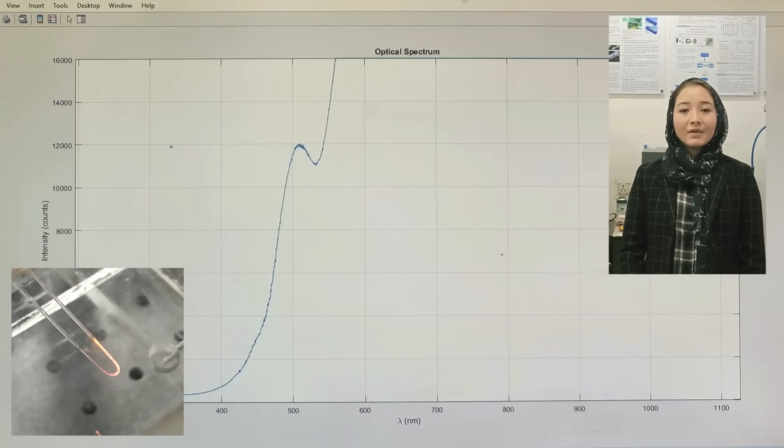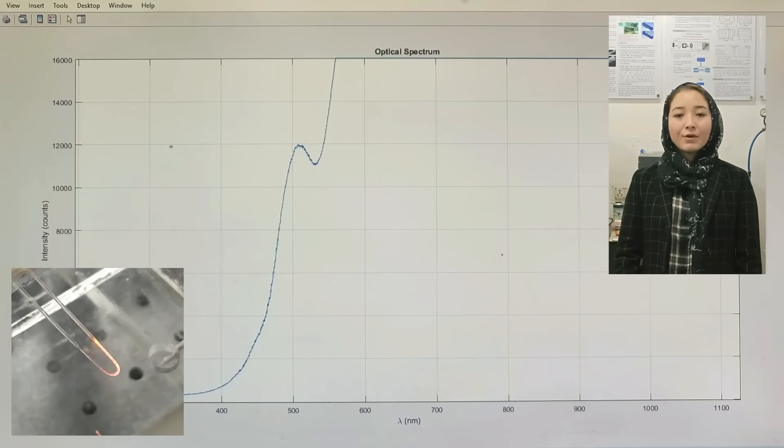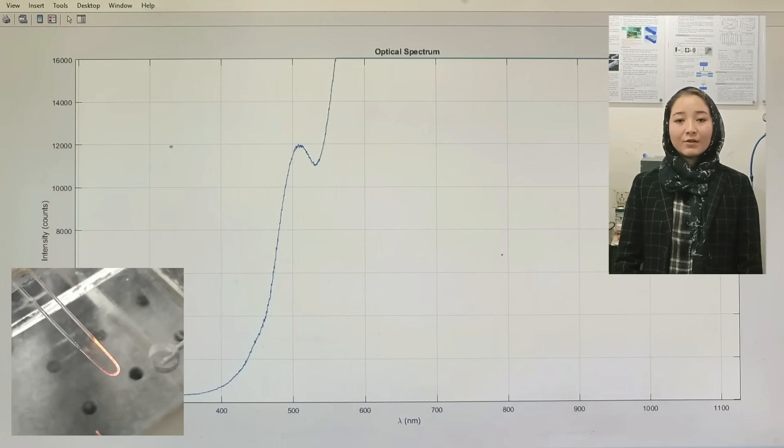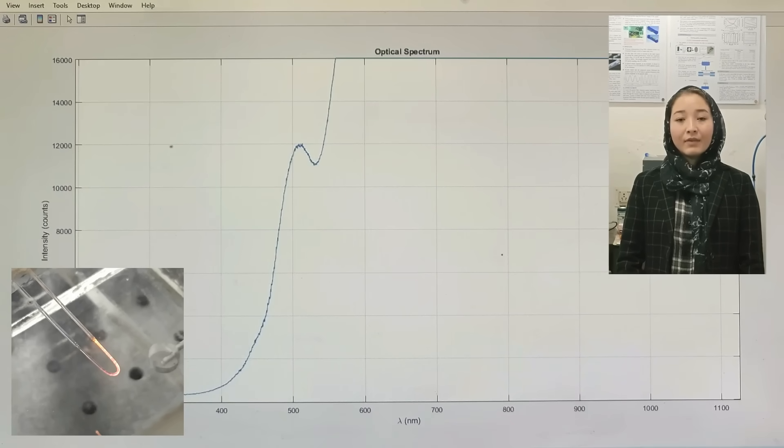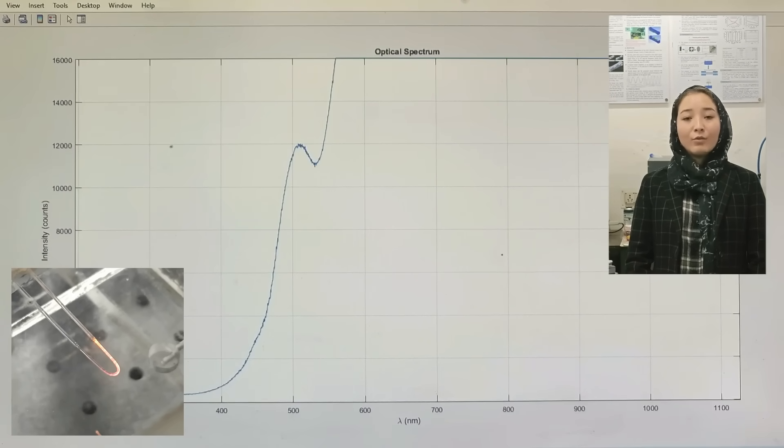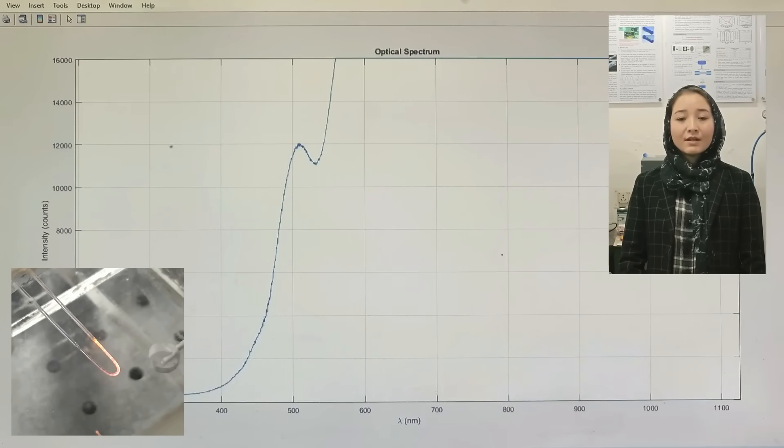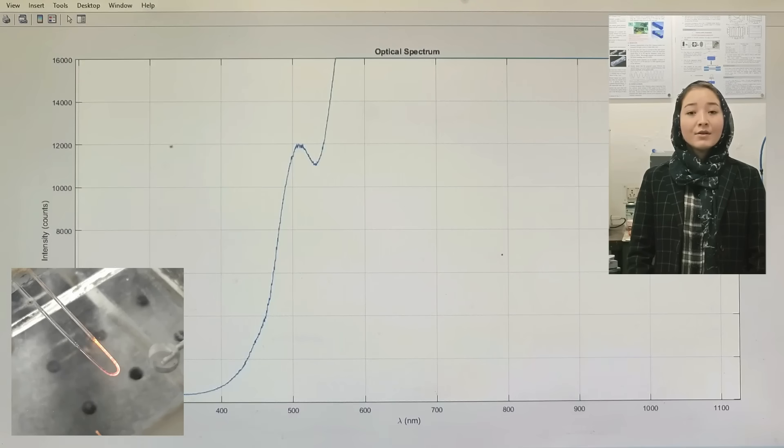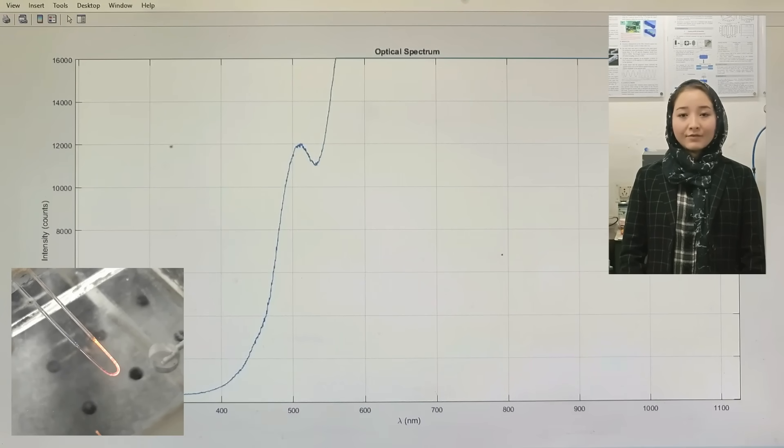I am Fatima Bano, a research scholar working under Professor Sunil Khijwania at Indian Institute of Technology, Guwahati, India. We have developed a novel localized surface plasmon resonance based optical fiber arsenic ion sensor and I am here to give the live demonstration of the sensor.